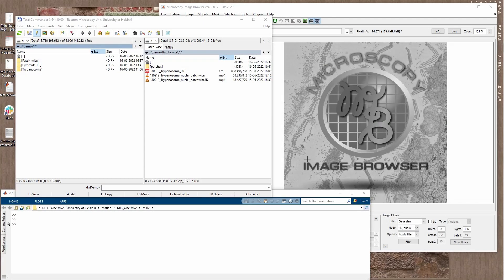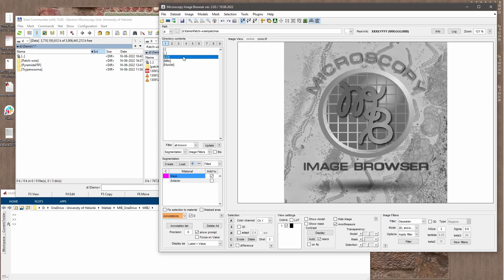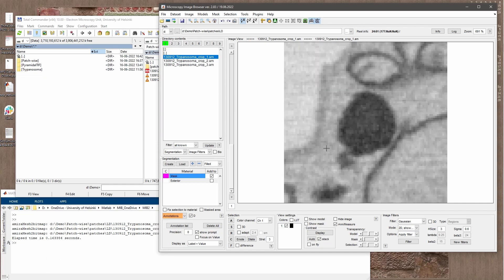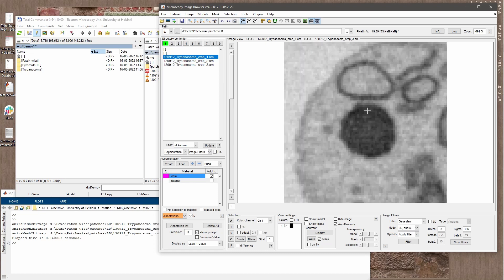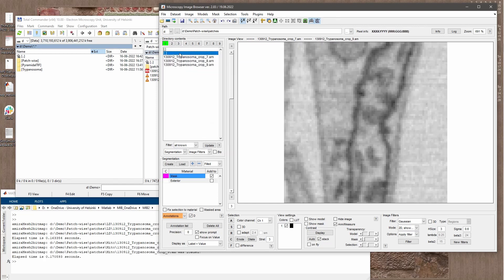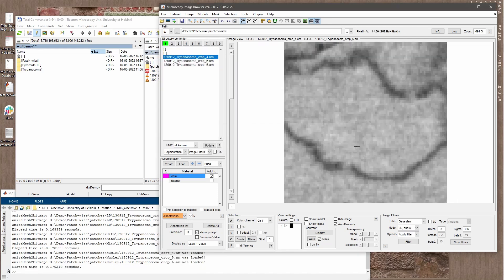Hello everyone, welcome to this new episode on image segmentation with Microscopy Image Browser. Today I would like to introduce a new deep learning workflow for image segmentation in patches. Instead of training on whole images where objects of interest are segmented, we do training using patches — small crops from the dataset showing examples of particular objects. For example, these images show lipid droplets, these show mitochondria, and these show examples of nuclear envelope.